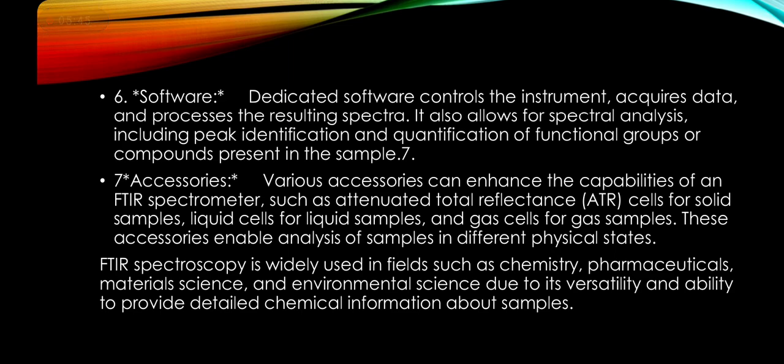Accessories. Various accessories can enhance the capability of an FTIR spectrometer, such as attenuated total reflectance cells for solid samples, liquid cells for liquid samples, and gas cells for gas samples.